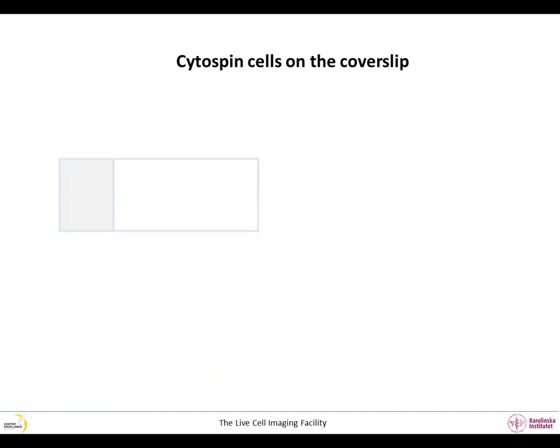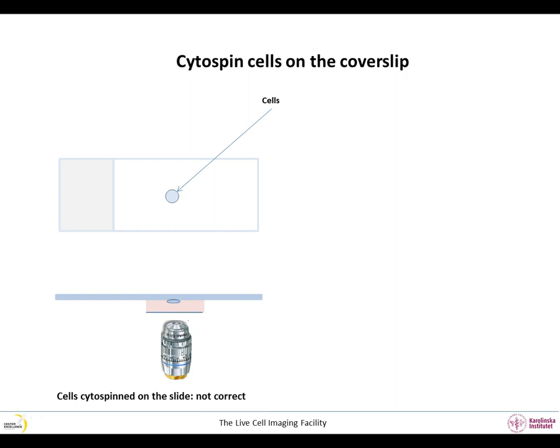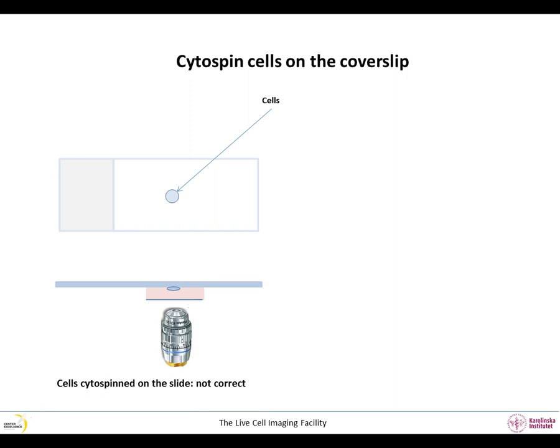Cytospins were designed to spin the cells on the slide, but as we explained earlier, this is not the correct way for imaging. Instead, you should cytospin them directly on the cover slip. Use 2 small pieces of tape to attach a clean cover slip to a slide, and use the slide only to hold the cover slip in the cytospin. This way, the cells will land on the cover slip.